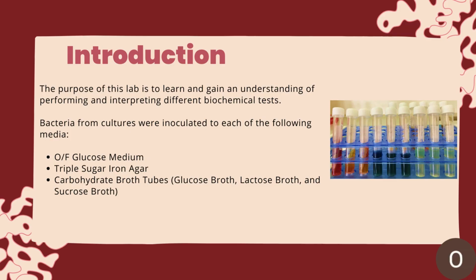Introduction. The purpose of this lab was to gain an understanding of performing and interpreting the different biochemical tests that we utilize, such as the oxidative fermentation glucose test, the triple sugar iron agar test, TSIA, and the different carbohydrate broth tubes, which were glucose broth, lactose broth, and sucrose broth.